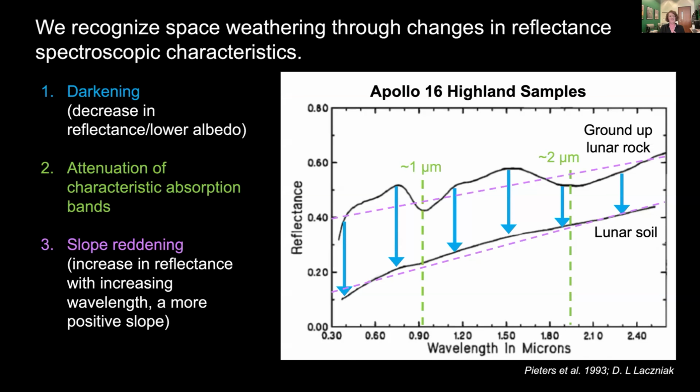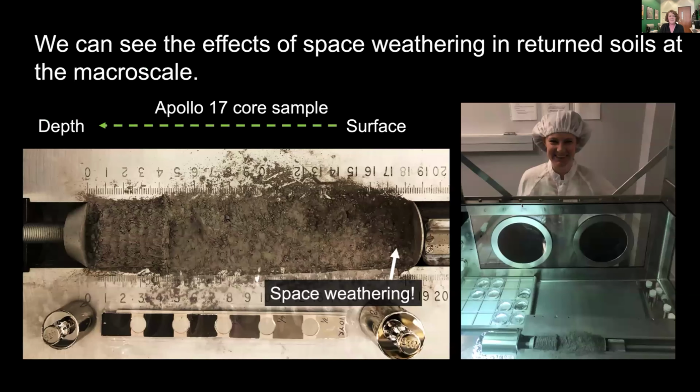So we knew some process was going on that was affecting this material exposed at the surface of the moon that was not affecting material inside of lunar rocks, that was not exposed to this interplanetary space environment. So that was our first clue that space weathering was happening on these bodies. Now we can see it in the reflectance characteristics of these samples, but we can also just see it with our eyes. This image here on the left is a lunar core sample that was collected from Apollo 17.